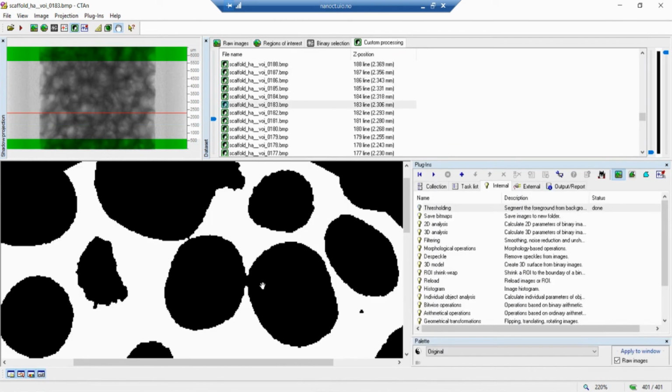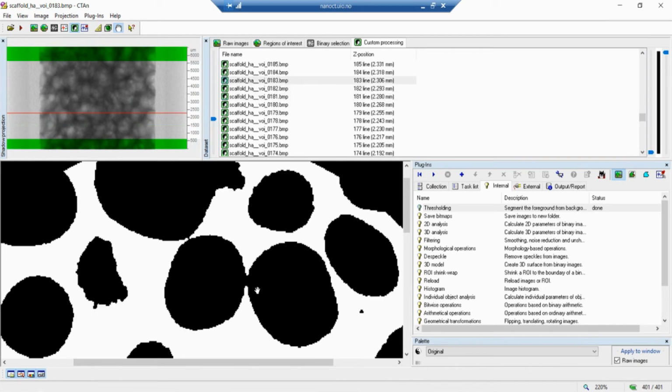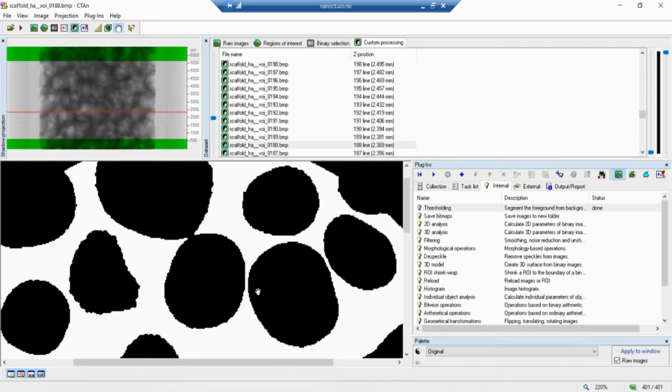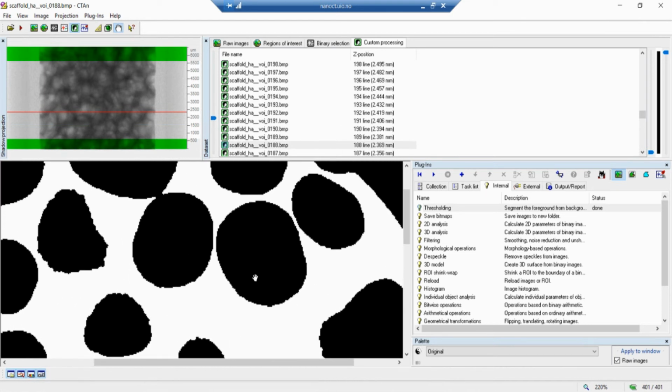At least at some point it is preserved, but it comes to another region where it could not be preserved. But if I had chosen a different threshold, I would probably overestimate another part of my sample, and anyways, you have to lose somewhere, and this is almost nothing for the quantification we want to have. So this is part of our error that we will have anyway.